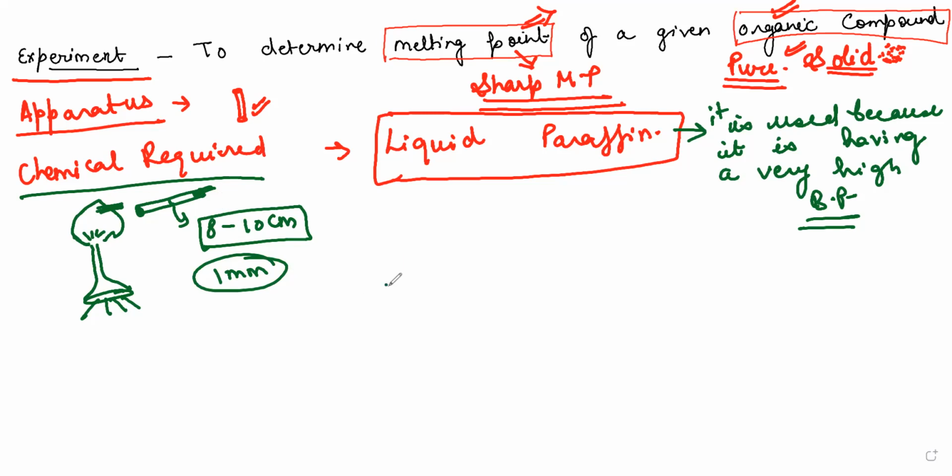Now what we have to do is make sure that you have a petri dish in which you have taken the organic compound whose melting point you're going to check. Just make sure that you finely powder it. You can use the spatula, rub it so that you make proper fine particles, and then bring that capillary tube near it and pour the content inside. Once it is filled up to approximately the right size, stop and tap it so that the content moves into a proper position.